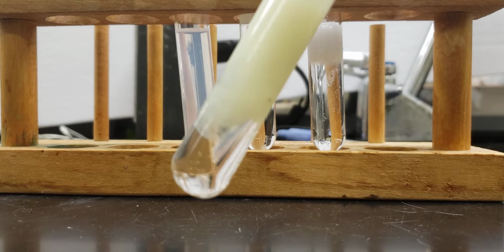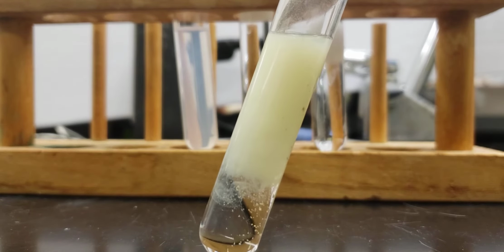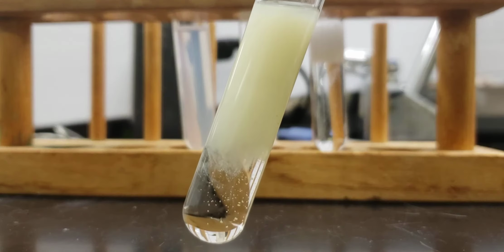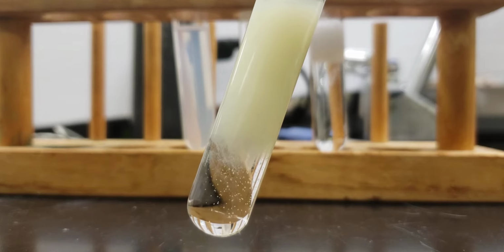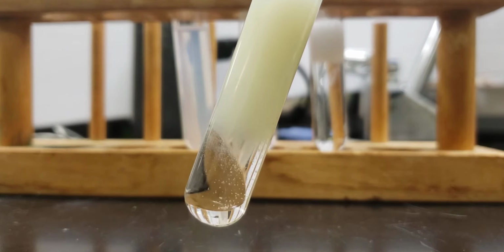We can shake it up, and here we can see this one in particular ends up having a very yellowish color, and it is precipitating out some solid, which is starting to flow down at the bottom.